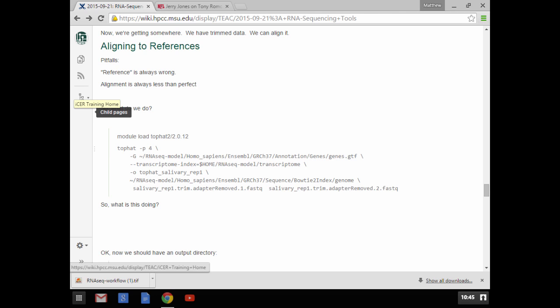It's a near neighbor, but there are at a bare minimum going to be SNPs, indels, mutations between the reference and what you have. It is highly likely that there are also whole regions that are misassembled, by virtue of the fact that this is a computerized process and requires a lot of effort to actually finish a genome, right? The human genome is into revision 37, I believe, or 38. The mouse genome is on MM10 right now, which means that they declared it finished, and then they finished it again, and then they got to 6 and 7 and 8 and 9 and just started calling them what they are, which is releases of the genome. They're not right. They're just the best you have.